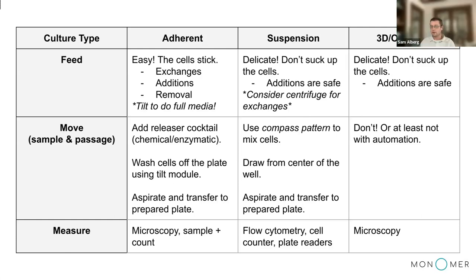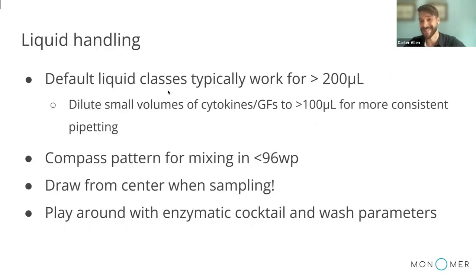I will also add that we can integrate with the Opentrons heater shaker module, which is not necessarily for growing cells, but if you are doing staining or washing, that's a really great module. You can stick the plate on it and let it shake for a while. And that can be controlled through Monomer software. Yeah, and it has the automatic latching, which means that it's very automation friendly. We place down the plate and then trigger an automatic close and open sequence. Well-designed module.